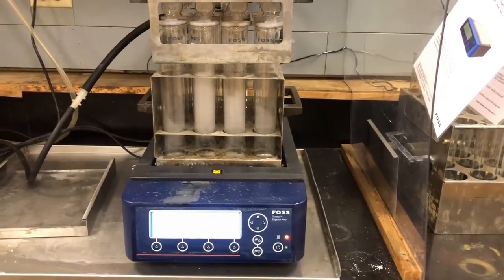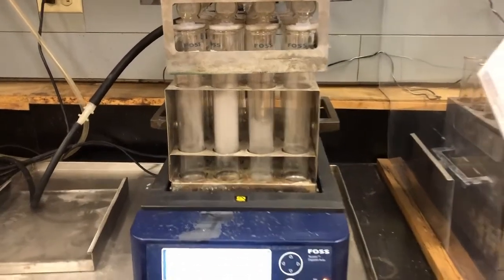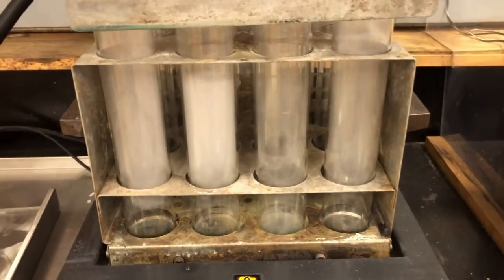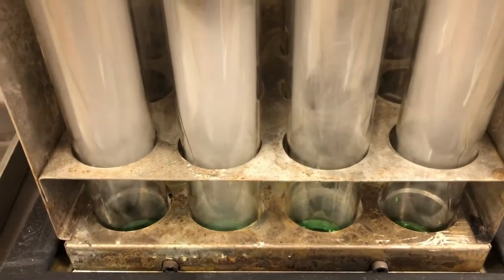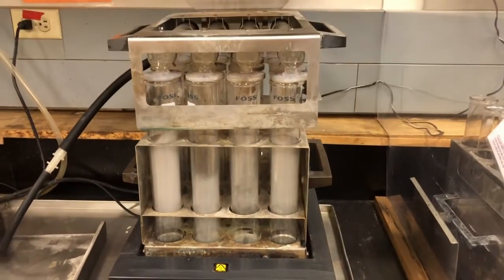So our digestion block has been running now for about 30 minutes, and you can really see now those vapors that I mentioned. You see that the samples are giving out a lot of vapors. You can't really see the samples, you can see them a little bit. You'll see those better when I can take them out. So the scrubber is working now.